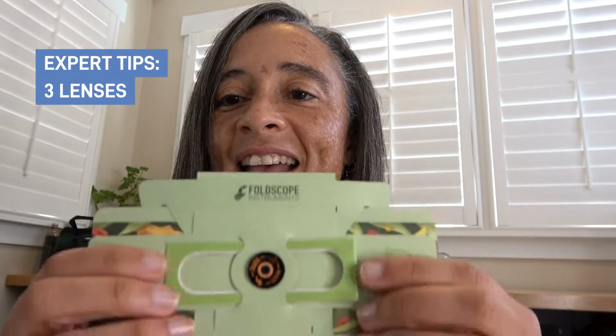That will give you just a little more distance between your sample and your lens. And then by adjusting your focus ramp, your sample should be able to come in nice and clear for you.